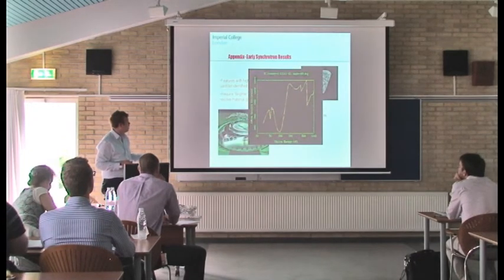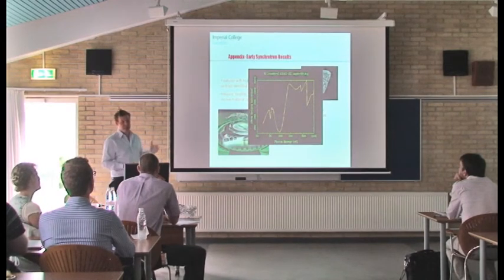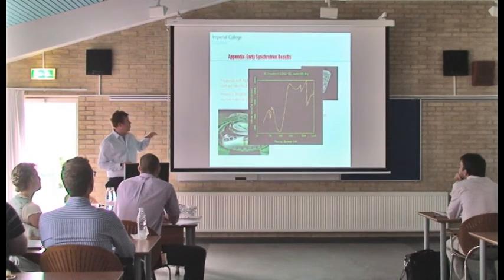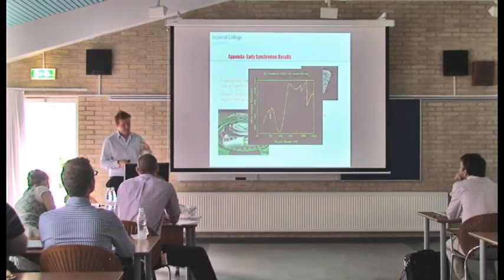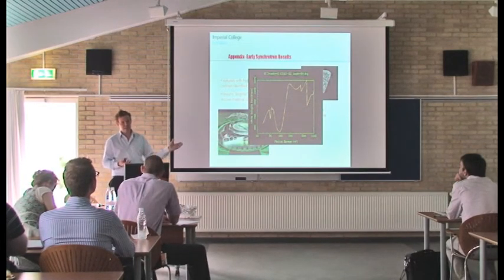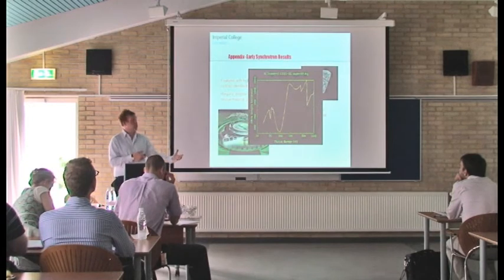If we use a synchrotron, we can vary the X-ray energy around the absorption edges of different materials, and that basically allows us to highlight different grains. So if we take the nickel edge, which is actually about 8.3 keV, if we alter the X-ray energy from the synchrotron above and below the nickel edge, it just highlights where the nickel is, and it's kind of a XANES type, so X-ray absorption near edge spectroscopy type phase identification technique. But we can do this in situ at the tomography stage.